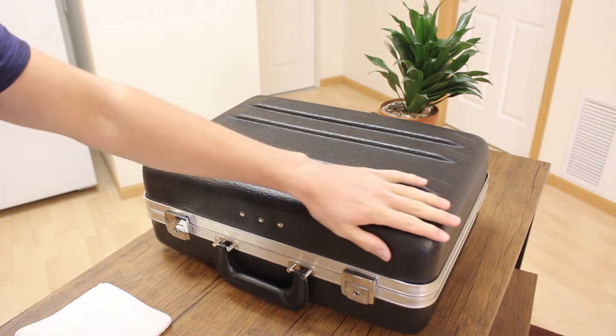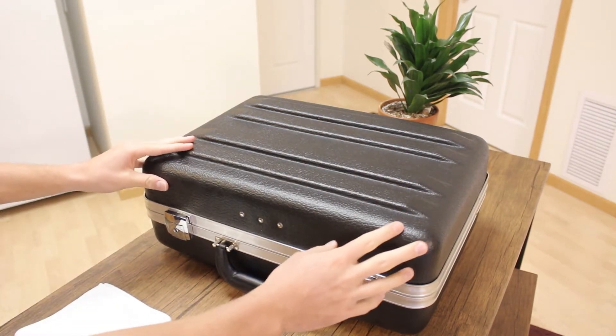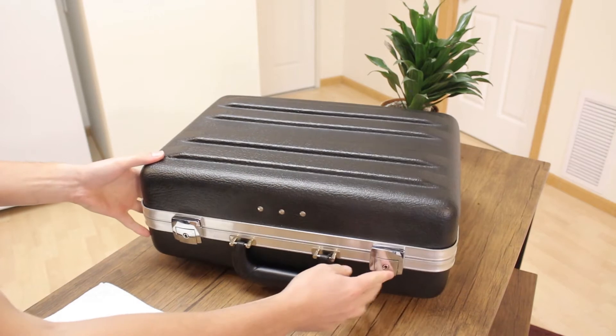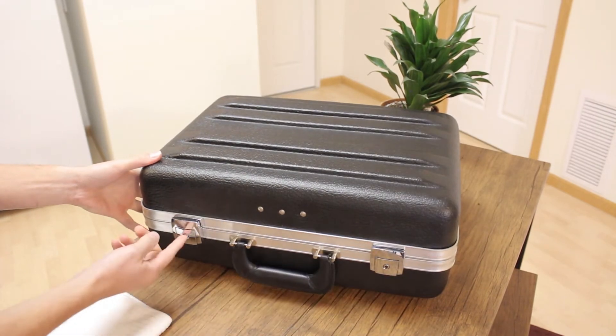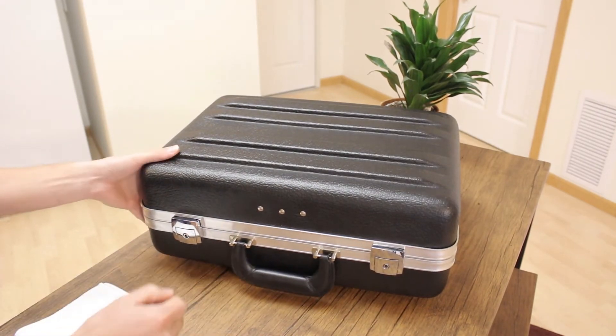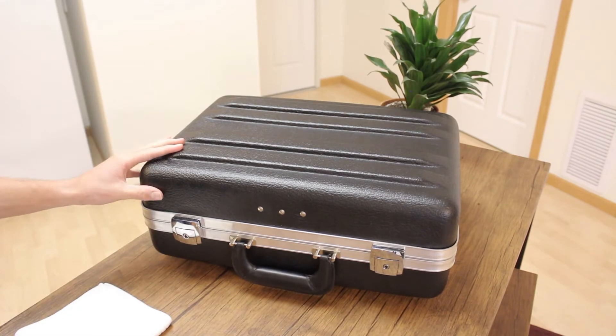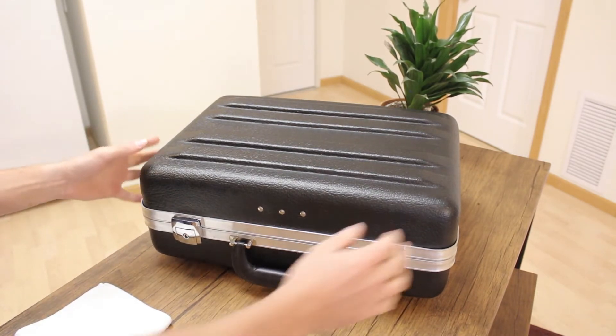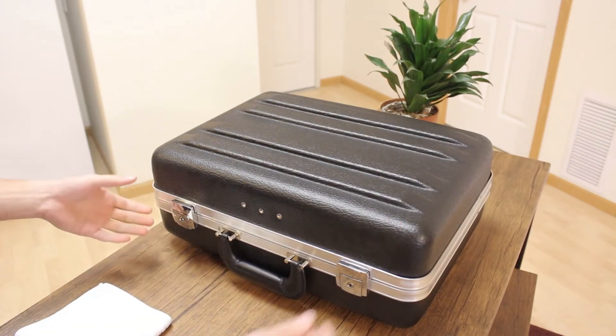It's actually a thermoformed case which gives it this sort of sleek look, and it's a hard plastic which I think just looks really good in the house. I also really like the hinges which have locks on them so you can actually lock it. I've had a test kit stolen from me — it's not a lot of fun.